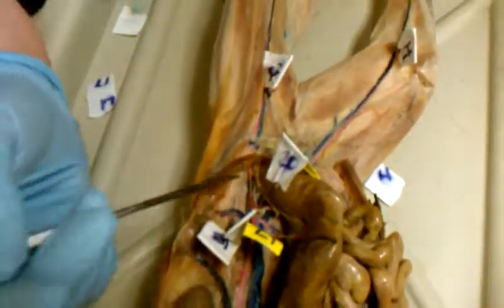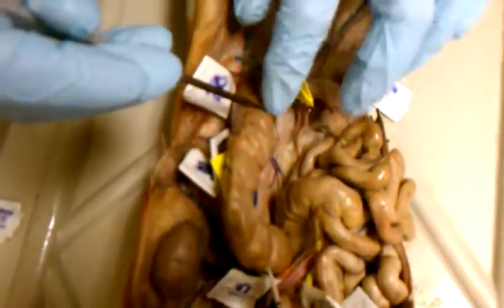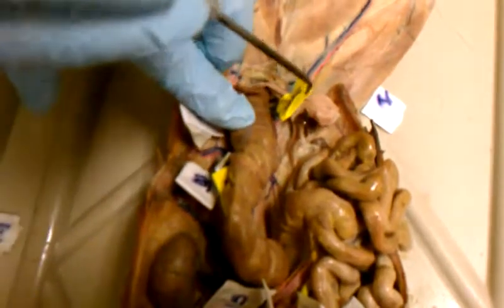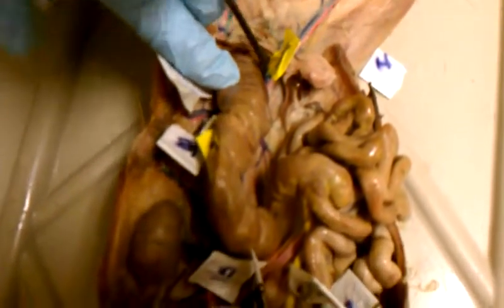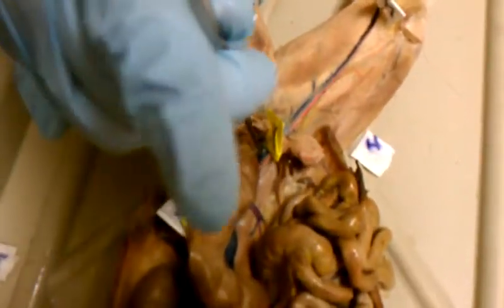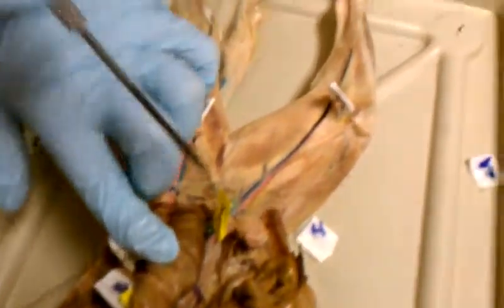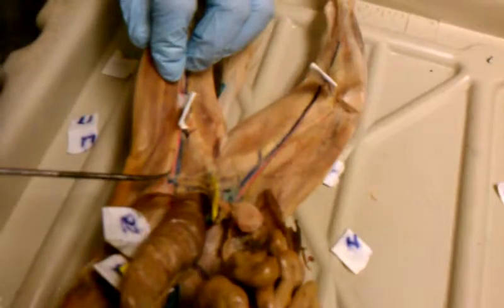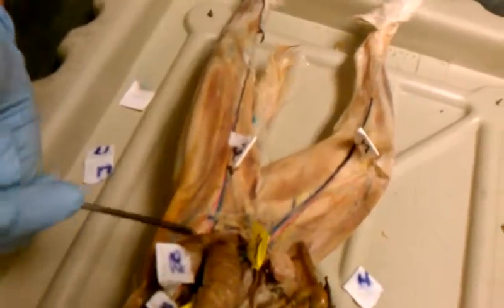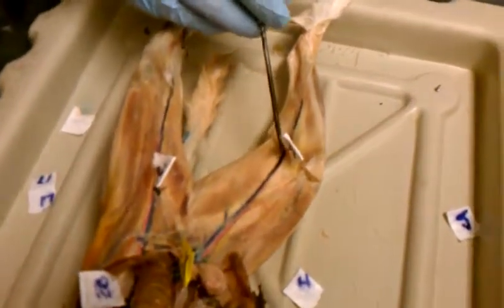And you can see the veins over here. The internal iliac vein kind of buries itself under the colon, right? And then the external iliac vein is the one you can see right here, and it's right beside the external iliac artery, and it's coming down. The external iliac artery turns into the femoral artery. And the external iliac vein comes down and turns into the greater saphenous vein.